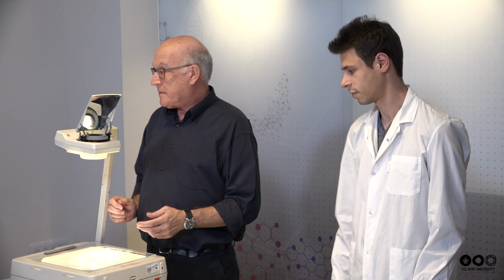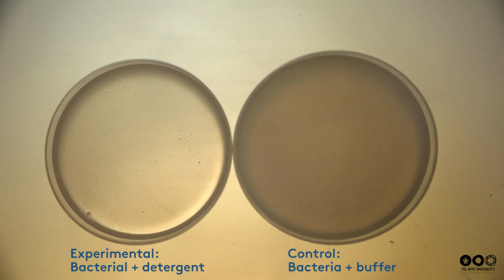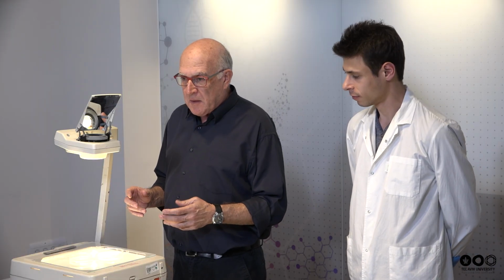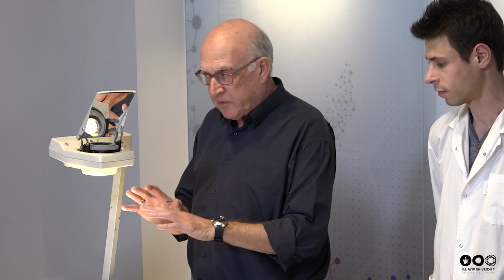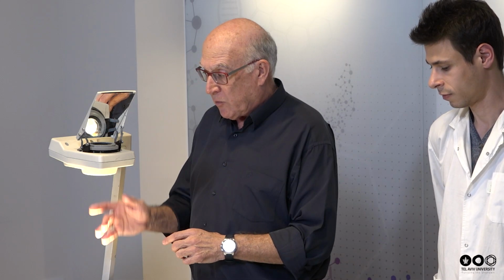Now what do we notice? In essence, what we see is that the control is turbid, it's dark, and the experimental has cleared. This is an interesting phenomenon. It's a phenomenon in physics in which the light coming through the projector is deflected by the bacteria. And each bacterium acts as an individual particle and deflects the light in a different direction. So the total amount of light that reaches the lens is less.